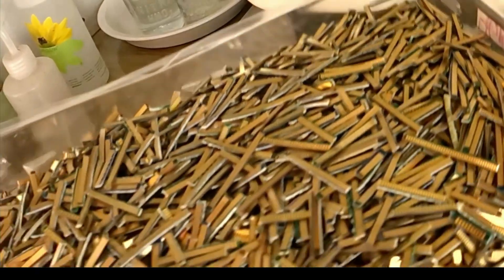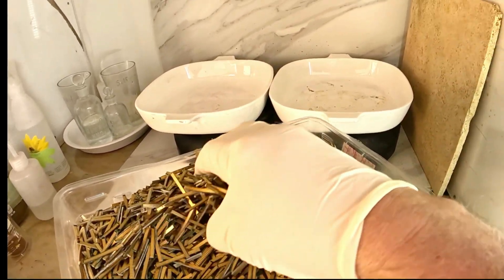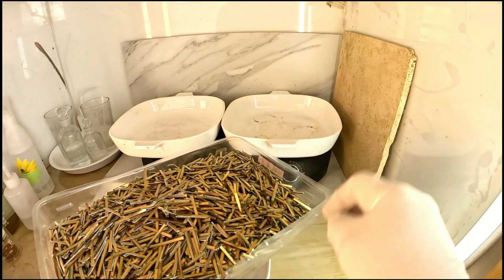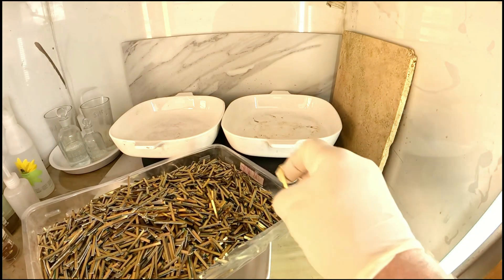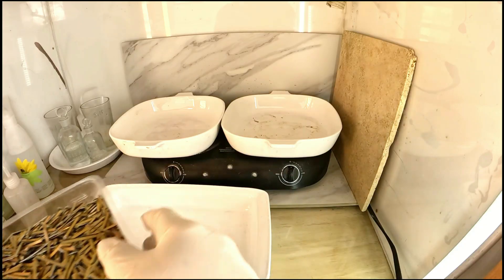Ever wondered how to turn old computer parts into pure gold you can hold in your hand? Today I'll show you how I refine RAM fingers from e-waste into solid gold, step by step, with tips for consistent results every time. Stick around because the transformation is remarkable.